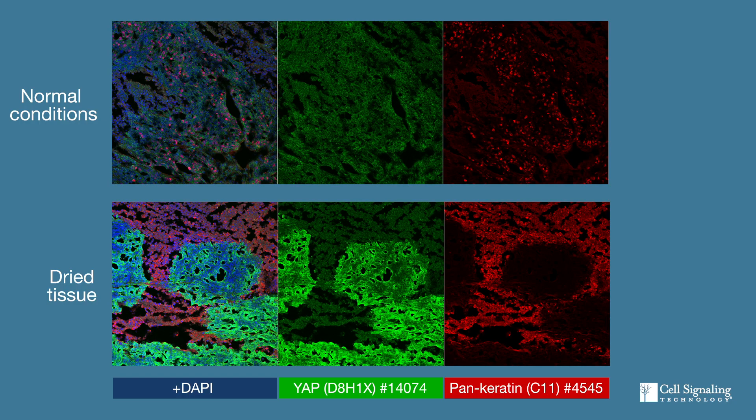Another common problem that causes too much signal is when the cells or tissue have dried out after addition of protein-containing buffers. This causes intense autofluorescence. To prevent this, make sure to change your buffers quickly, and use sufficient buffer to prevent drying during incubations. You can also make a humidified chamber — look for that video coming later.